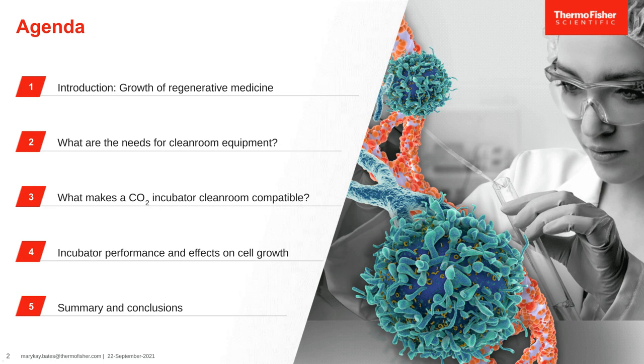Part 3 is about what makes a CO2 incubator clean room compatible, and this is kind of the meat of the talk, and I think it's very exciting. I hope you will too. Part 4 will be just reviewing, like I said, some of the data that I presented a year ago, showing how incubator performance affects your end results because it affects how your cells grow. And then I'll finish up with some conclusions and a little summary of my main points.